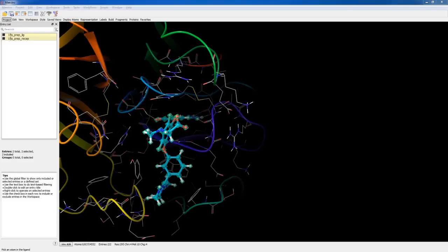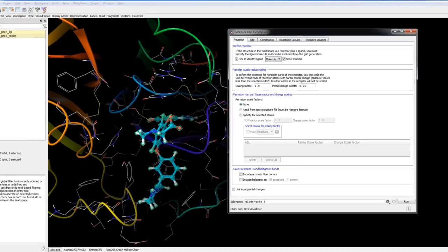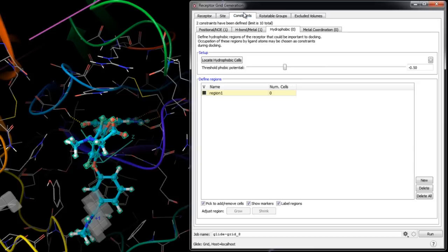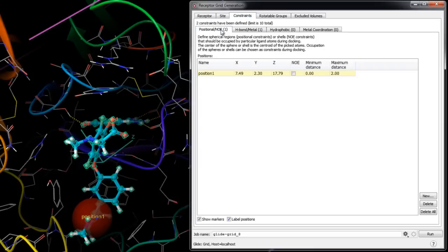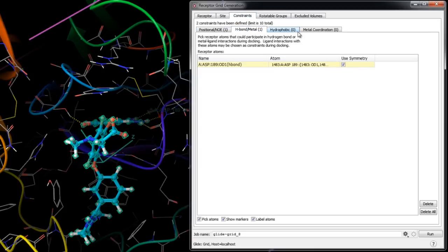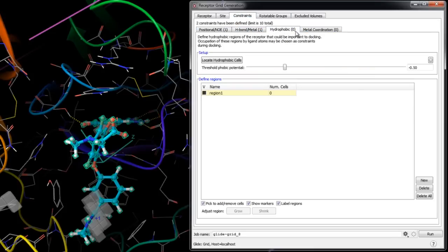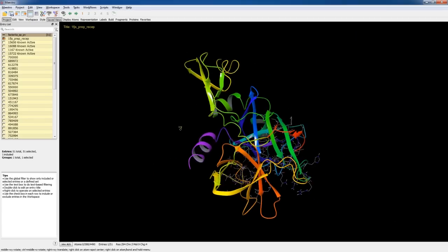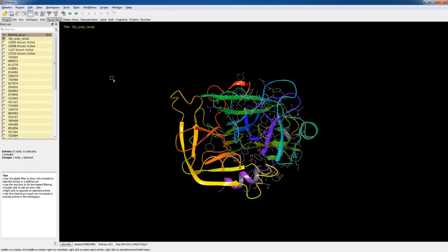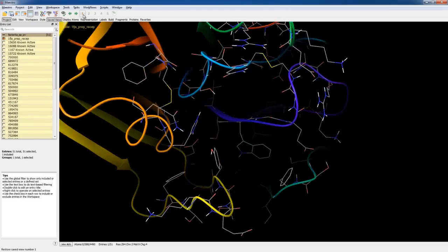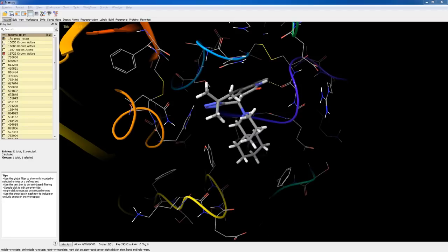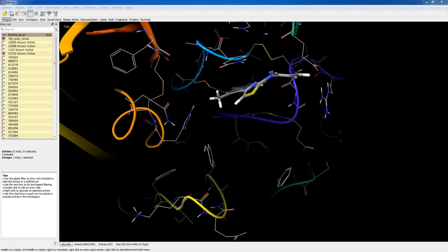In this video exercise we will demonstrate how to use the receptor grid generation panel to set up and start a grid file calculation job. Grid files represent physical properties of a volume of the receptor, specifically the active site, that are searched when attempting to dock a ligand.